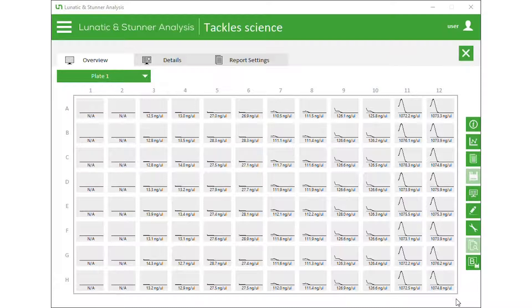Once Lunatic is done measuring, it passes the results over to the analysis software. The overview of the plate shows the concentrations and the absorbance spectra from all the samples. If everything looks good, we can just export the data to a report from here. But let's zoom in to look closer at the results.